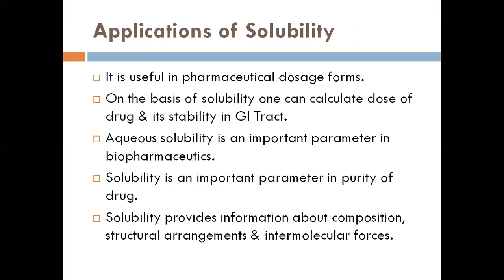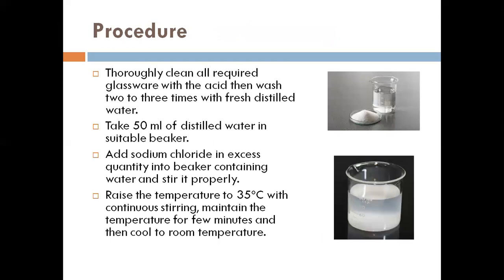Aqueous solubility is an important parameter in biopharmaceutics. Solubility is an important parameter in the purity of a drug. Solubility provides information about composition, structural arrangements, and intermolecular forces. Then, about procedure. Thoroughly clean all required glassware with acid and then wash 2 to 3 times with fresh distilled water. Take 50 ml of distilled water in a suitable beaker.